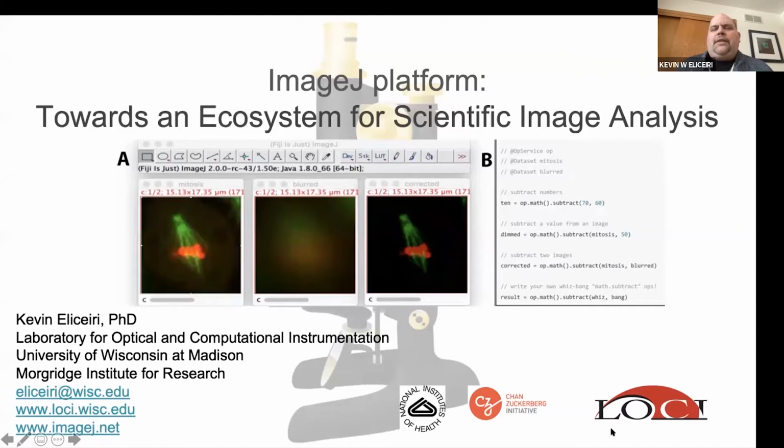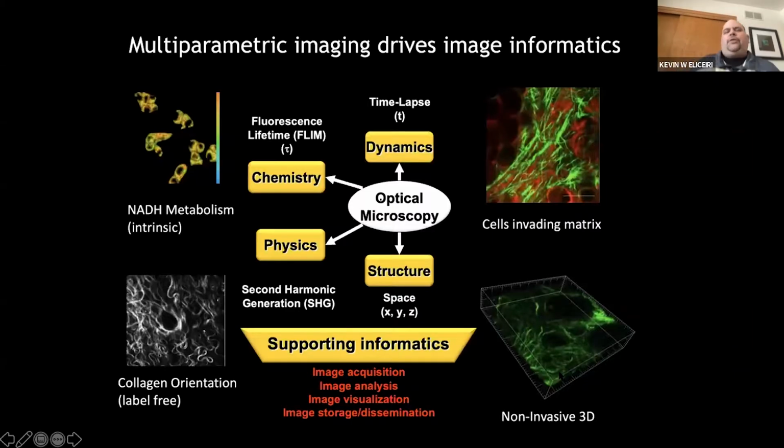And so I'll be talking about this idea of an ecosystem, that we're trying to go beyond just one application, but have help and support. And as many of you know, I really believe in the concept that we want to empower bench biologists to do great work and to make the tools as easy to use and extensible as they can. So I'll talk about that. I think it's always good to know who you're talking to and the bias.